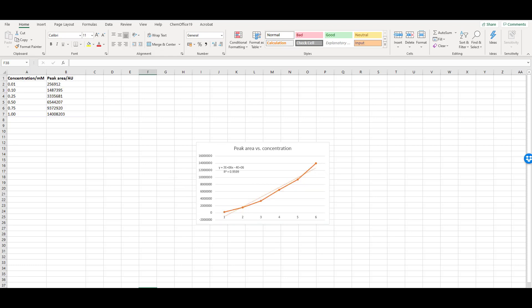If you select a line graph instead of an X-Y scatter, the X axis will be incorrect. It will assume that you want the axis to be 1, 2, 3, 4, etc. instead of your concentration values, which are not necessarily evenly spaced. This means your data points are distorted and you'll get an incorrect linear regression equation.